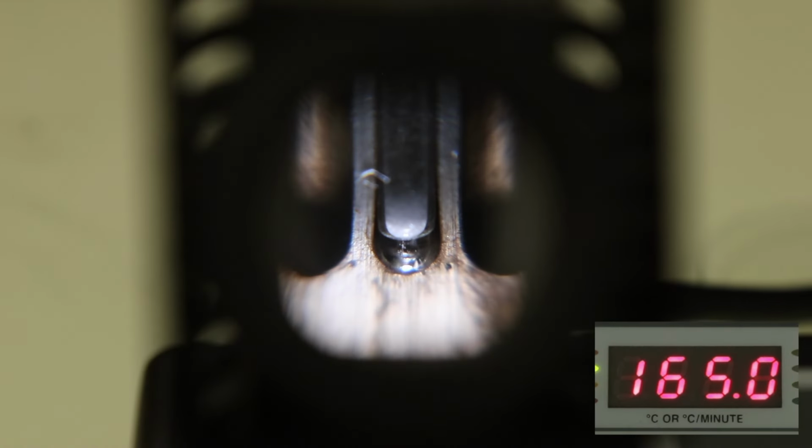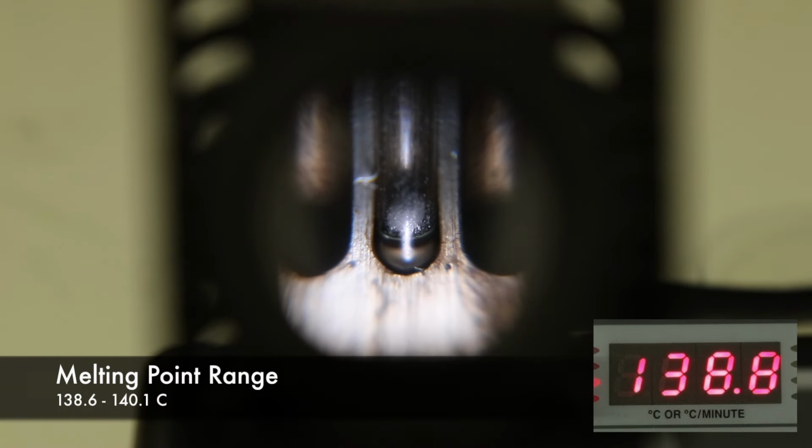I first placed it in around 165 degrees Celsius and it melted really quickly, so I then put it in again a lot lower, around 110 degrees Celsius. And nothing happened, so I started it again, this time around 135 degrees, letting it warm up. This solid started melting around 138.6 degrees and finished around 140.1 degrees Celsius.